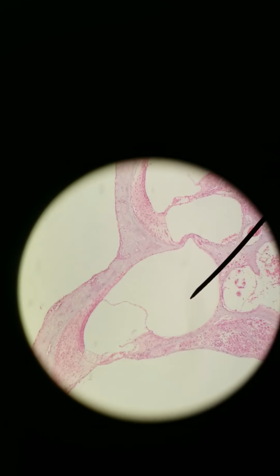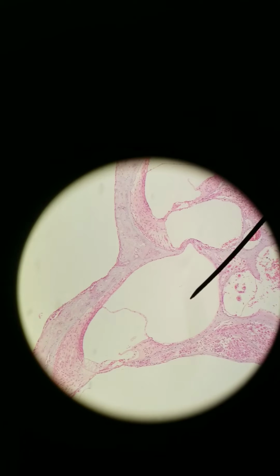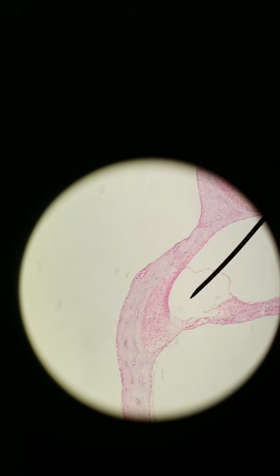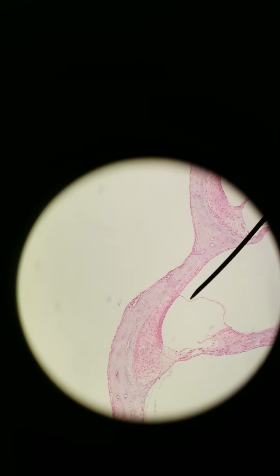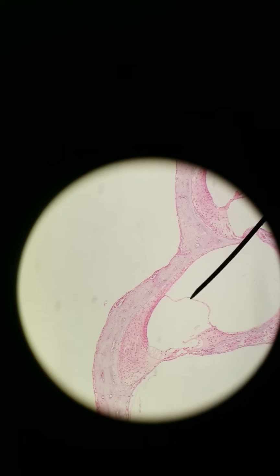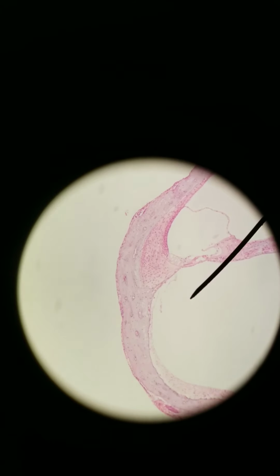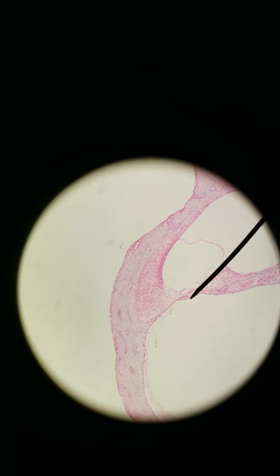So this space is fluid filled. This is where you'd find perilymph: perilymph in scala vestibuli, perilymph in scala tympani. Inside of scala media, you'd find endolymph. Again, the dividing point between media and vestibuli is the vestibular membrane. Dividing scala media from tympani is the basilar membrane. It's at the base, basilar membrane.